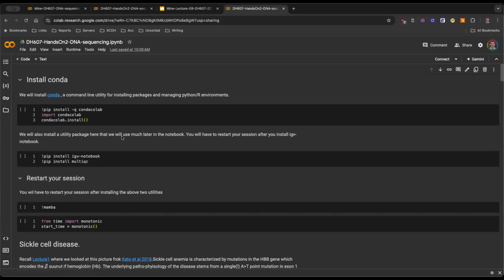Everyone on the notebook? If you don't have a laptop, you can just sit next to somebody who has, and you can do this together. Everyone here?